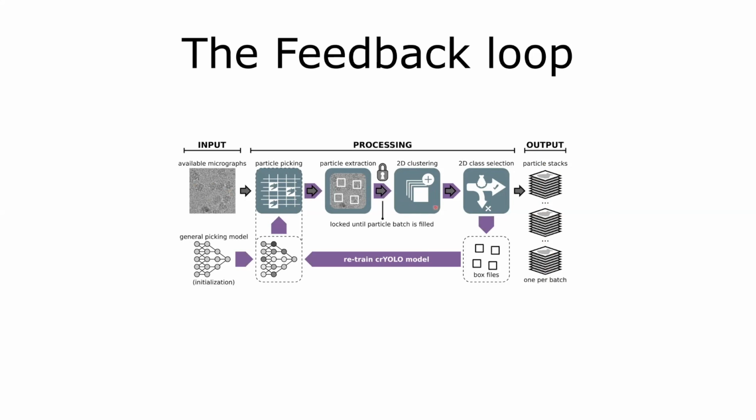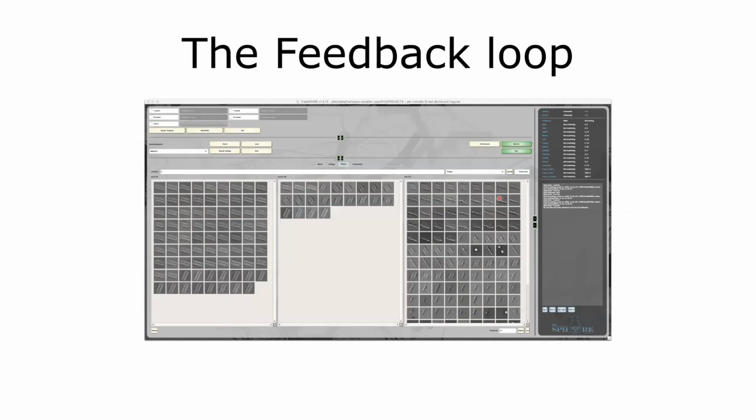So you might see that this depends on the 2D class selection working as intended, so that it can ideally separate good and bad groups of particles. To assure that, TranSPHIRE offers a built-in Cinderella retraining tool. You need to stop your session first, because otherwise it's hard to make sure the GPU is not used twice, and then click on the retrain tab.